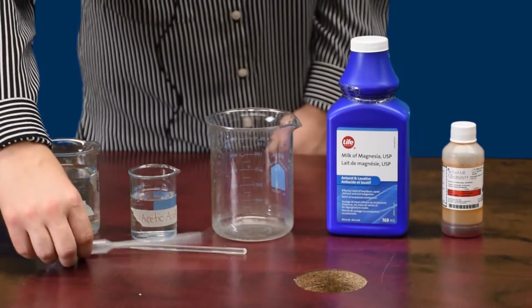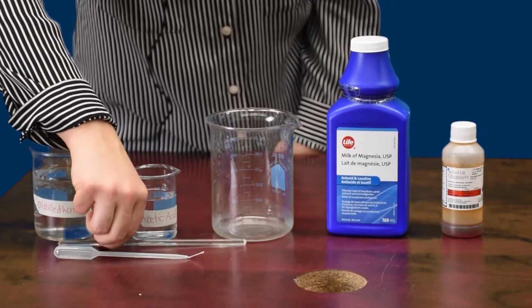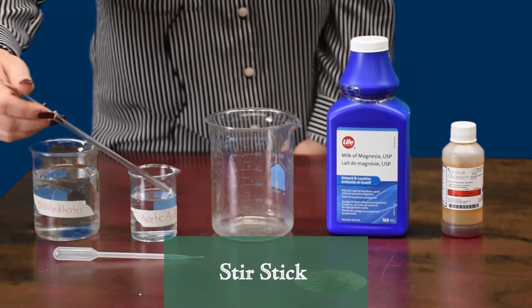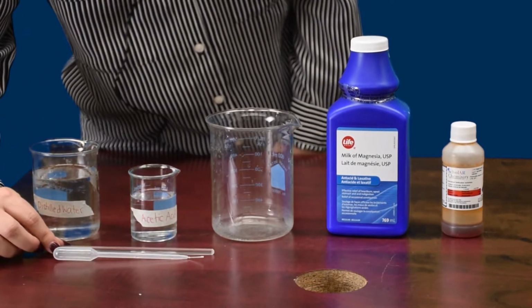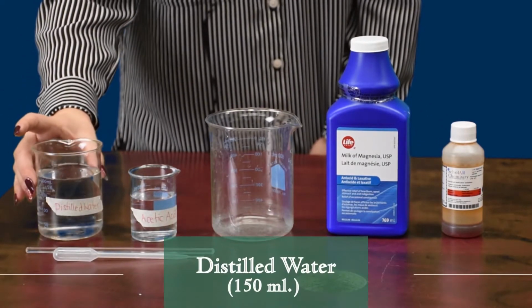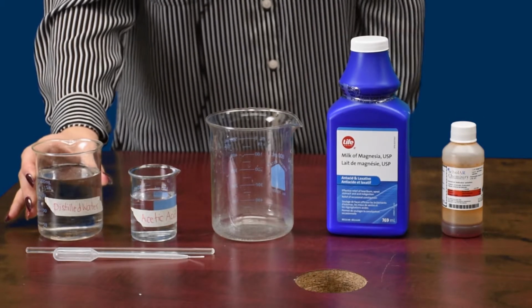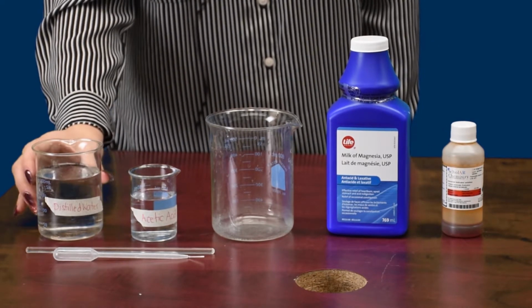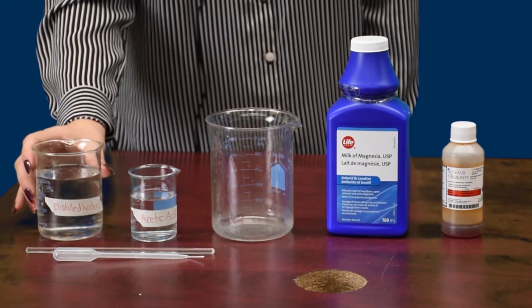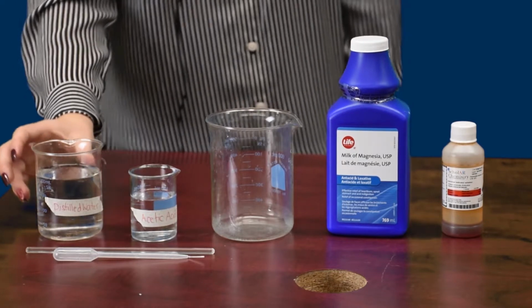The first thing you will need is a dropper. The next thing you will need is a stir stick or something to stir your chemicals. You will need some distilled water, specifically about 150 milliliters of distilled water. It's important to use distilled water for this experiment and not tap water, as tap water has a lot of salts and other compounds inside that can have an effect on your experiment.